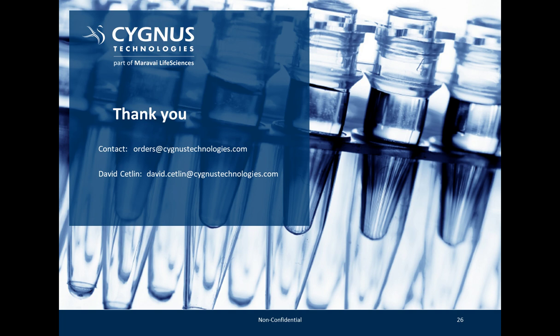However, with all of the push that our customers are now organically going after, they want to see this data used in that sort of manner. So when customers bring this up to the FDA, it makes the FDA consider places where this data set could supplement, I won't say replace yet, but could definitely supplement live viral clearance data. And with everyone's active use of these kits, maybe we can start convincing the EU and the FDA to look into this even further.